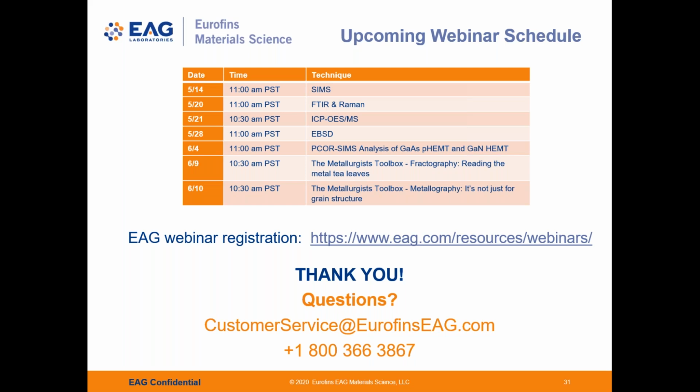And there is another question. What effects would sample surface roughness and electrostatic charging have on measurement and analysis? Surface roughness and electrostatic charging. Oh yes. What effect on analysis?